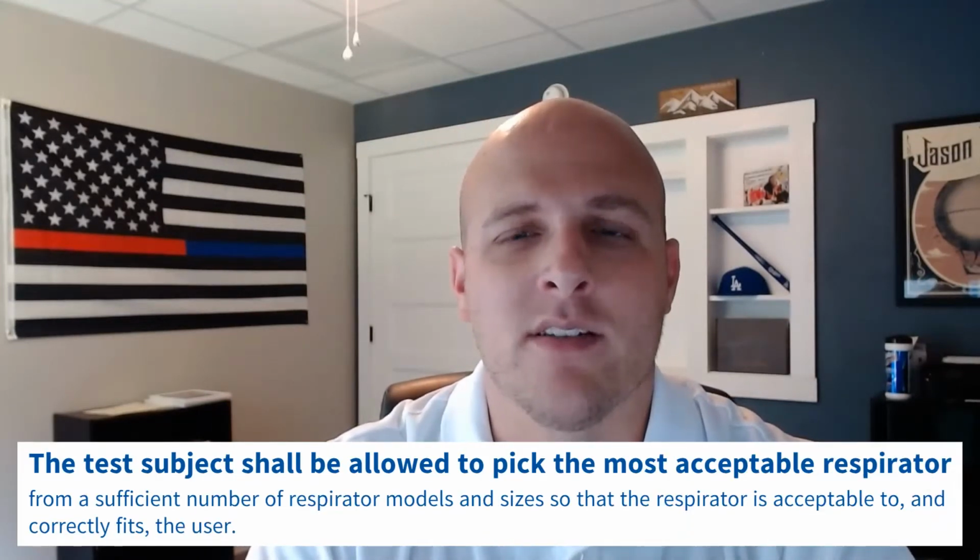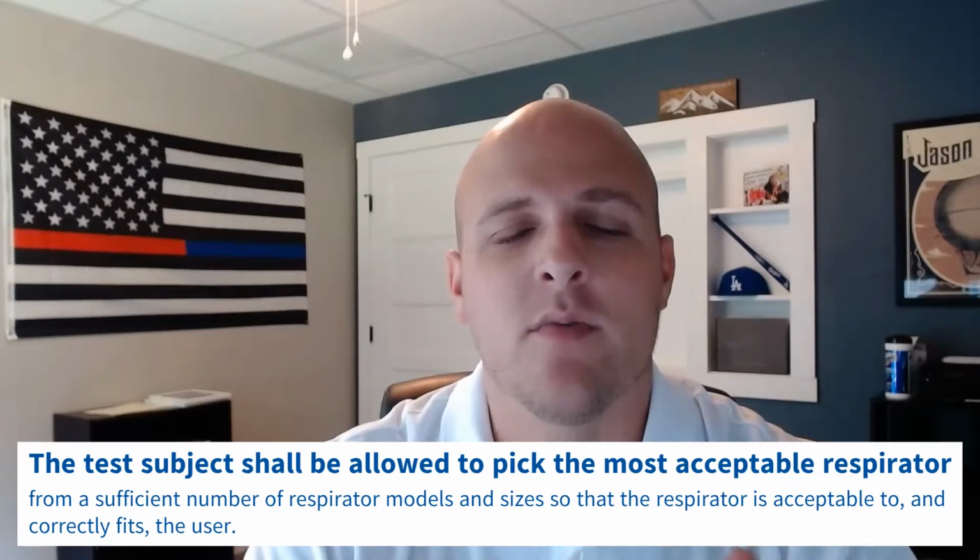Now, one thing you're also required to do, which we talked about in another video, is give them multiple models and styles so they can get a respirator that fits them properly. And so when they're doing this fit test, one of the things you have to do after the fit test exercises are completed is ask them how it feels. If they say, it feels terrible, it's really tight, it's hurting, it's irritating me, whatever it may be, then they have the option of choosing another mask and doing a retest. And you have to give them that option.